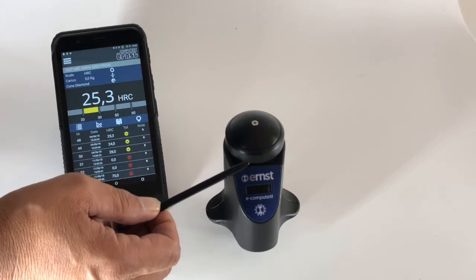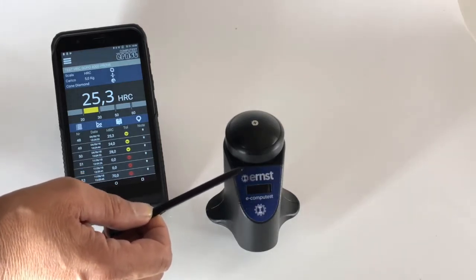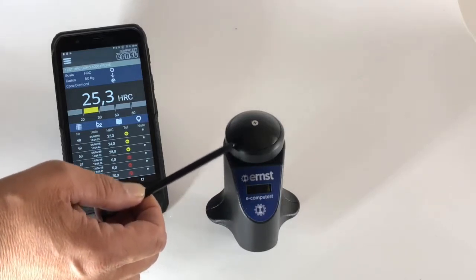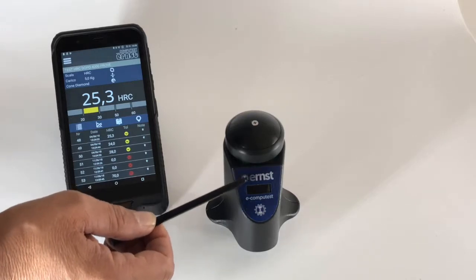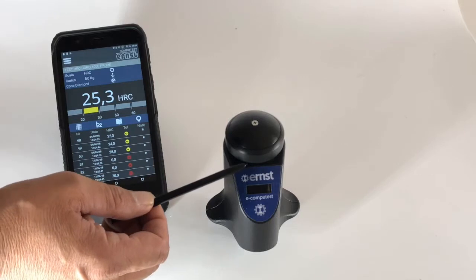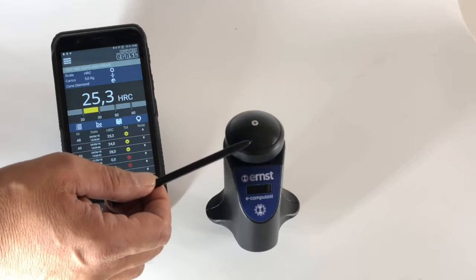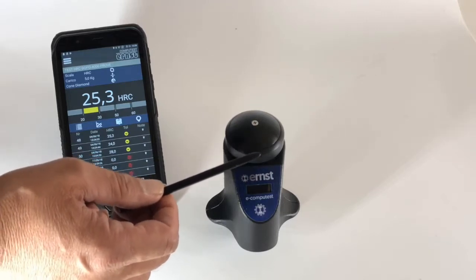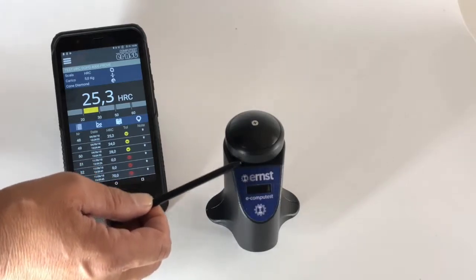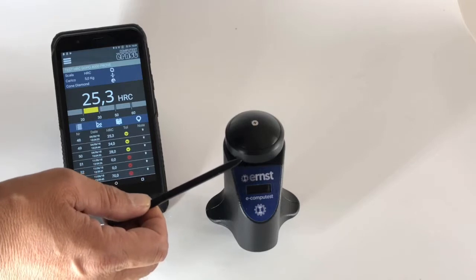The repeatability of the instrument is better than 1%, or plus or minus 0.3 HRC. All available scales are supported — you can choose whatever scale you prefer for your testing procedure. The system is not influenced by mass, and because of the five kilogram load, it can measure samples.